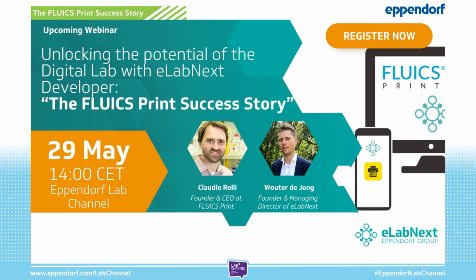We're all thrilled to have you joining us for our latest webinar entitled Unlocking the Potential of the eLabNext Digital Lab with eLabNext Developer, the FLUICS Print Success Story. In this session, our speakers will introduce researchers, lab managers, and software developers to the transformative potential of the eLabNext developer platform. This webinar will not only take you on a deep dive into the platform itself, showcasing how to get started and the tools at your disposal, but will also provide you with a real-world success story from FLUICS Print.